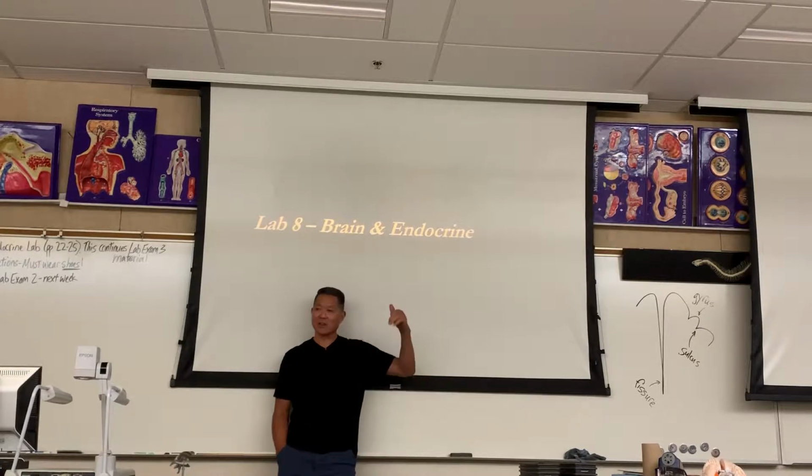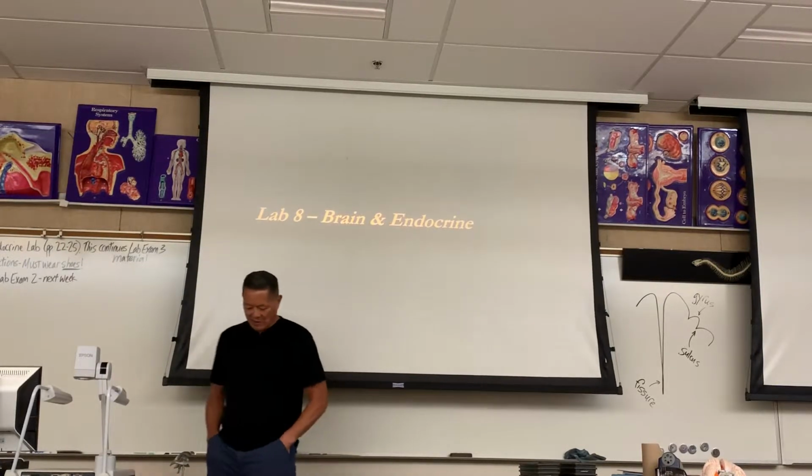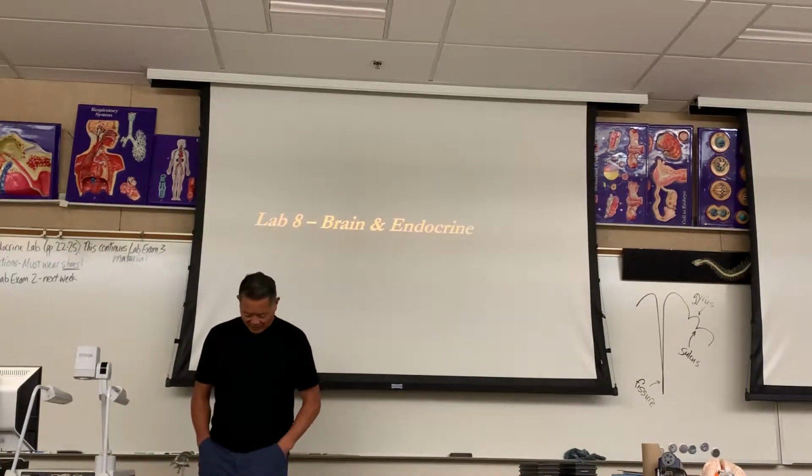Some stations are going to be microscopic images off of projected slides. Turn to page 25. Those are two possible questions that would be projected images on slides. Everybody write that down. Page 25, we have pyramidal cells.